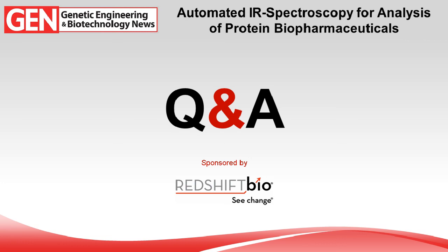All right, thanks, Dave. Stick with me. We have another question for you. An audience member would like to know, is there any water vapor subtraction applied to the MMS spectra?